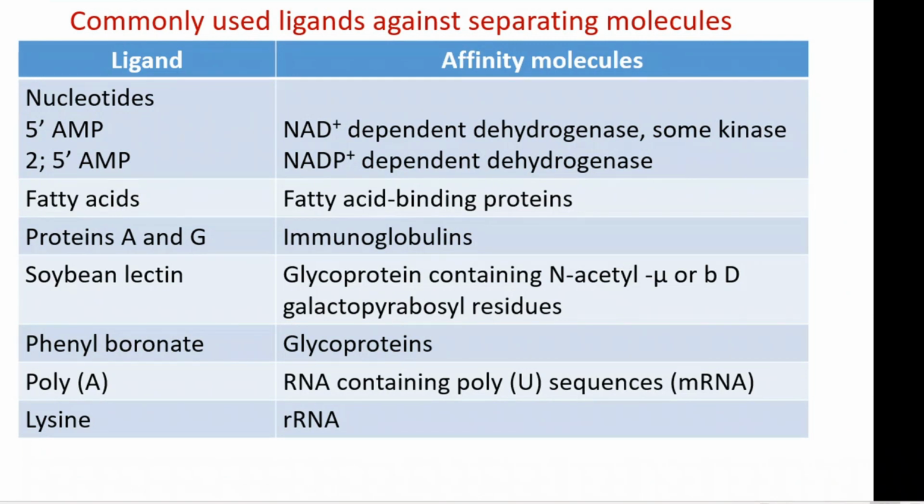it will have uracil molecules. The uracil is always complementary with adenosine. So when naturally the RNA molecules have enough poly-U at the tail, then automatically the poly-A tail, which is attached in the matrix, will have the capacity to attach with this poly-U run. So when the poly-U gets attached, the mRNA molecules will be isolated.